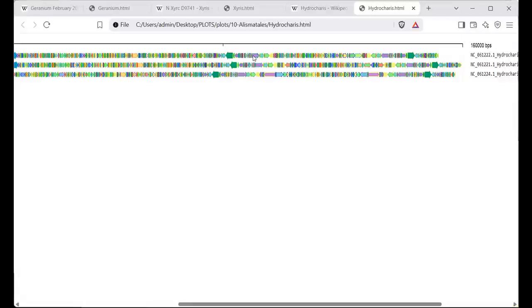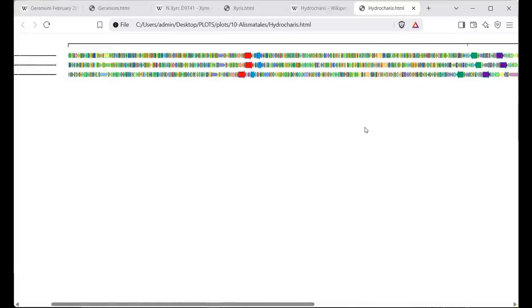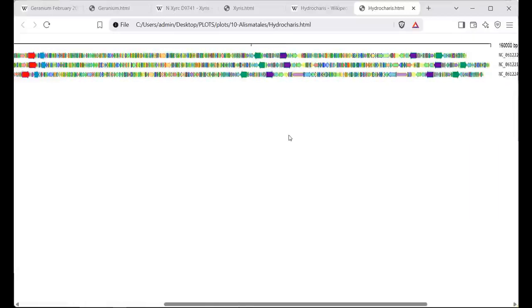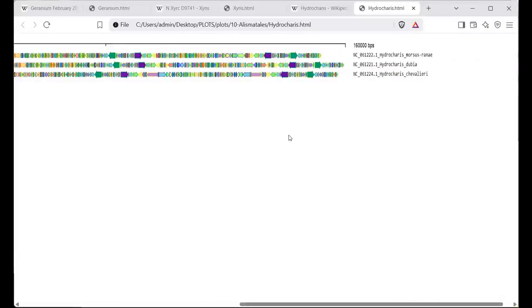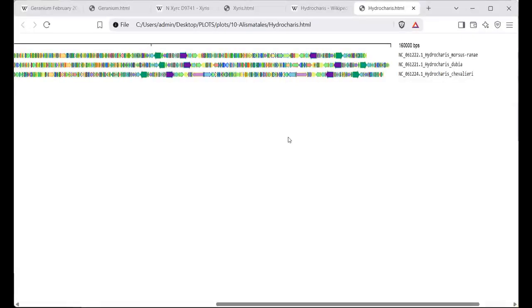But apart from that, the sequences are really fragmented. So this is a pattern I have seen in a small number of sequences, maybe 100 or so among all of these plots I manually went through. And after going through them manually, I also wrote some scripts to analyze or identify these patterns.